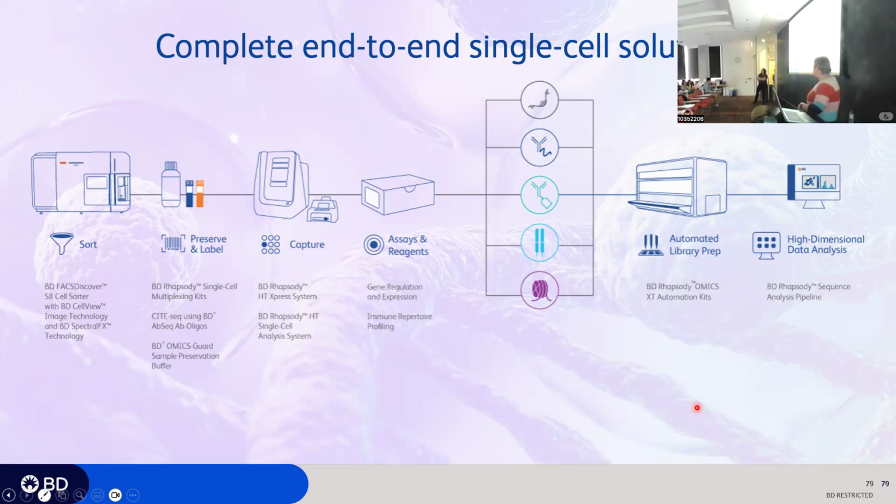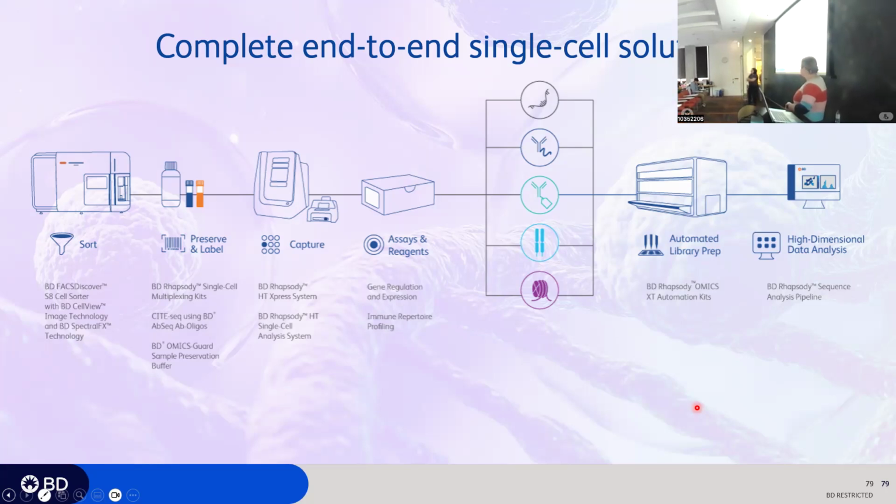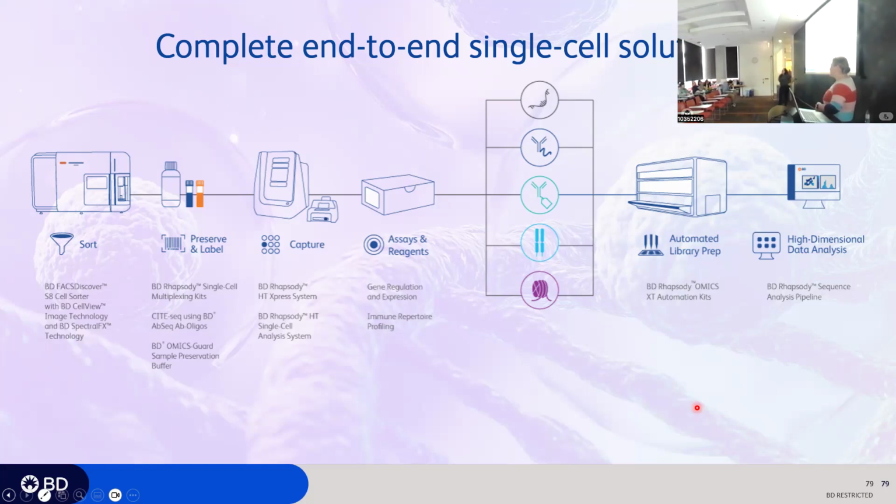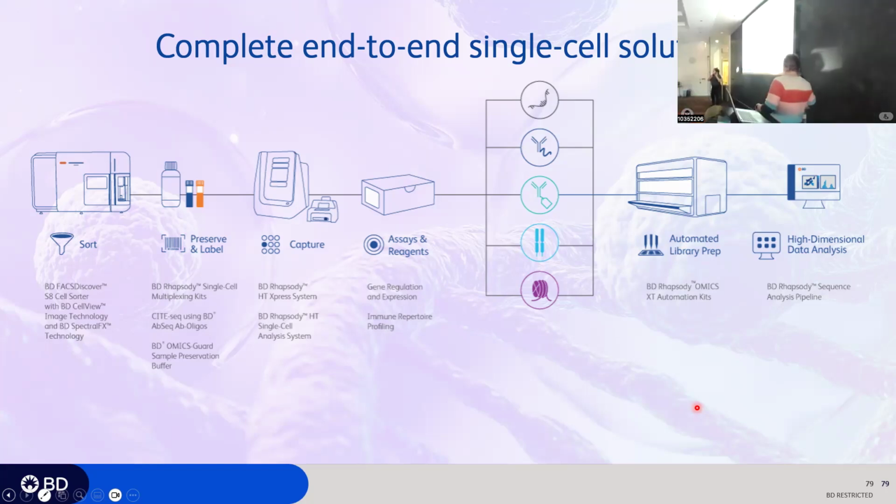I would say there's a bit of a cost benefit as well, probably 25 to 30% cheaper with just list pricing. Plus, if you do decide to do some multiplexing, because we can load more, you can get more per lane. Another thing to consider: if there are labs that are close together and collaborate, those are options for that pilot project. That's an 8-lane project for that 5K, for example, so you could split things up, depending on how that works. Just an option.